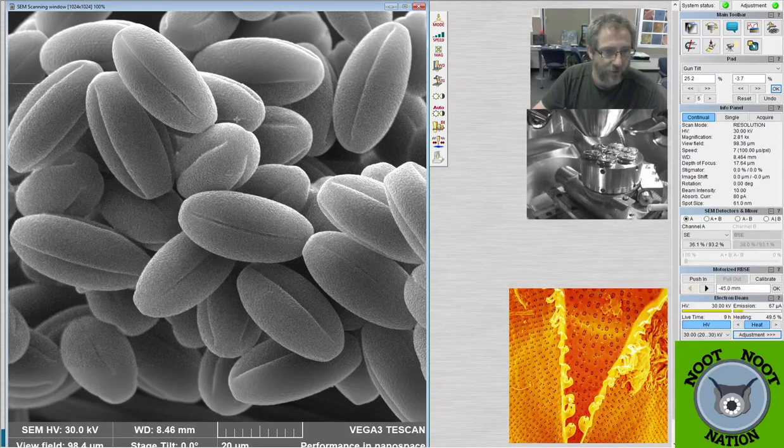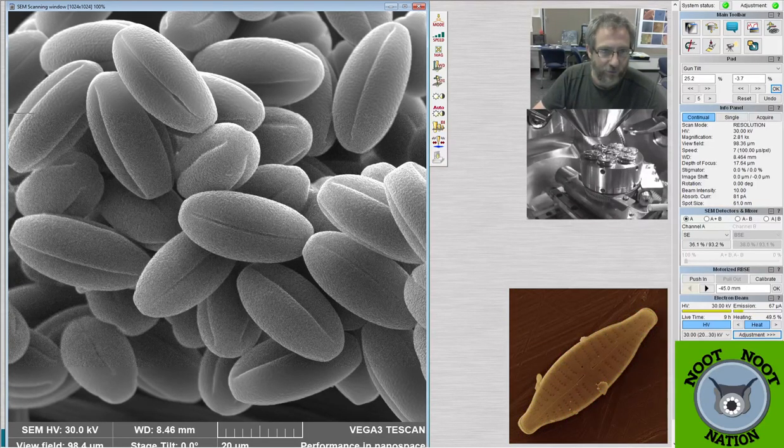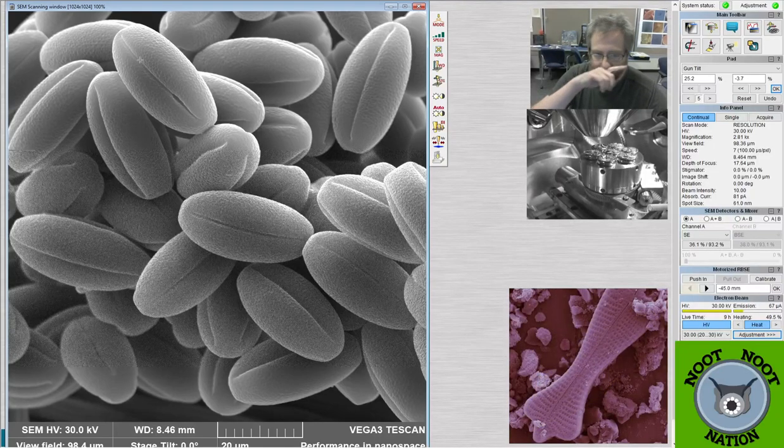You can see that it's actually threefold. So there's a fold or a crease here, but there's actually three of them. If we look at the whole grains, you can kind of see that end on, that that's the case. And these also are covered with little dimples, right? You probably could see they look kind of like rice grains or something, but in the SEM you can see a lot more detail with respect to that.